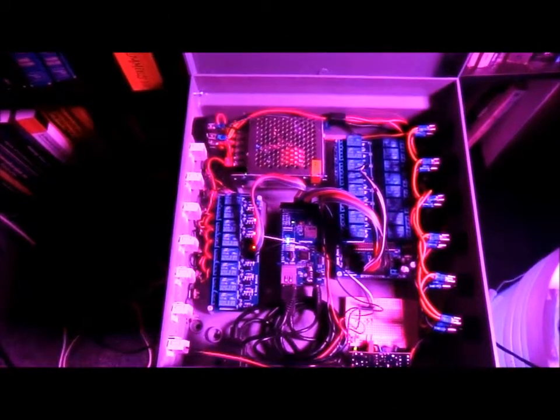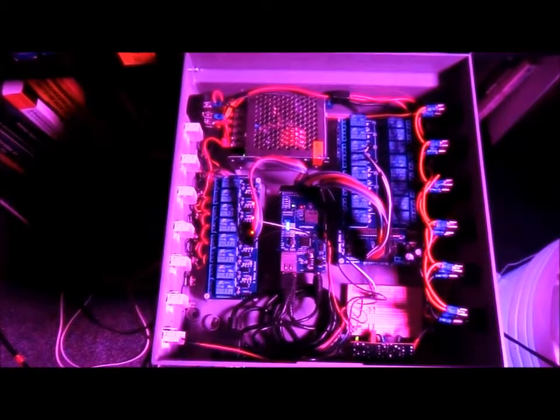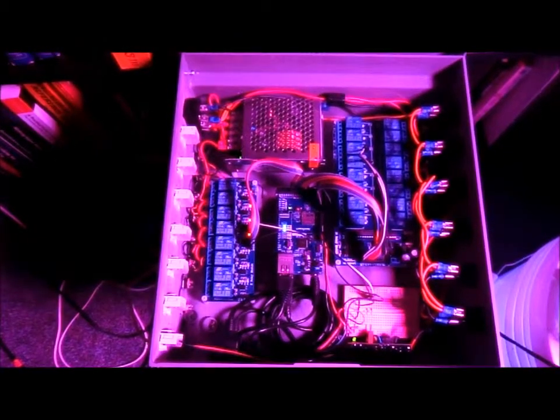Good morning everybody and welcome to another episode on the Raymond Ranch. I wanted to show you what I've been working on for the last week and a half. This is the control system for the units that we're building in prototype.